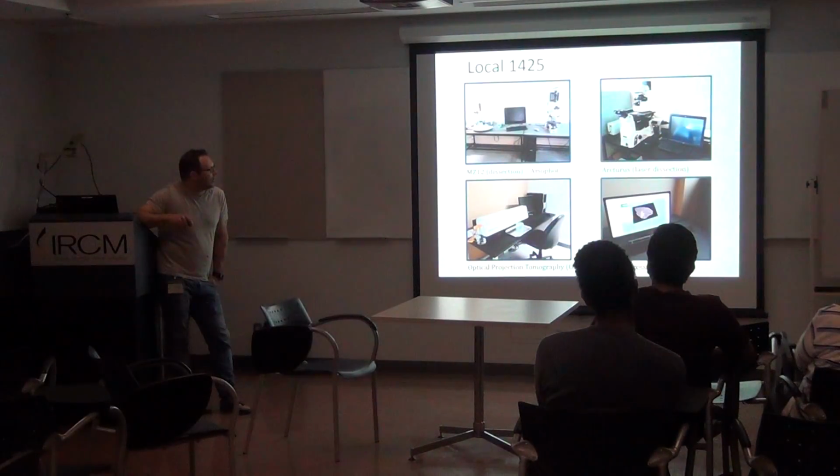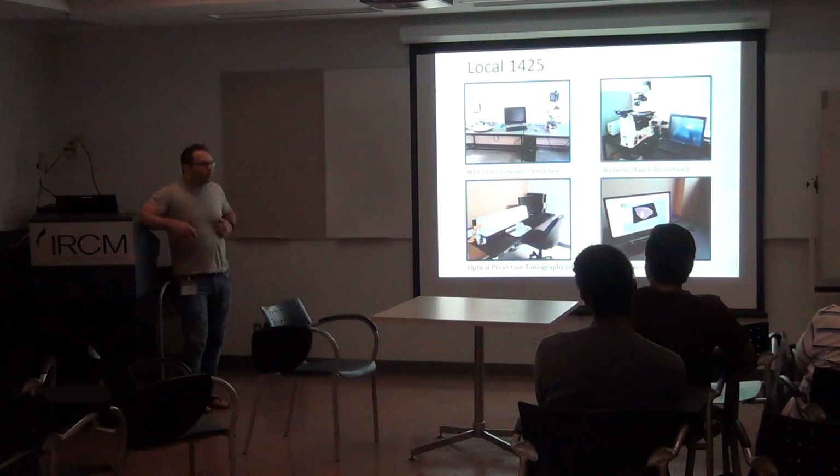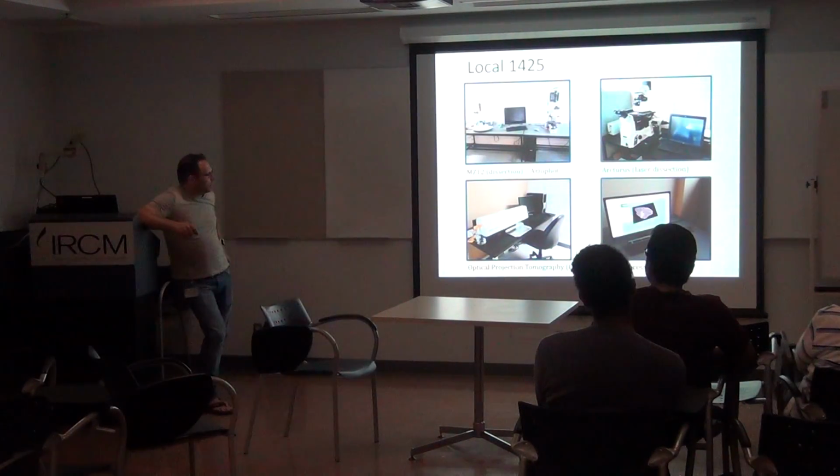We do have a laser dissecting microscope. It has a laser device that you can control the position of. So you can have a specimen and draw on the screen where you want the laser to cut your specimen, and so you can get a precise portion of your specimen under the microscope from the laser dissection that you do. Actually, this one is now on the 5th floor.